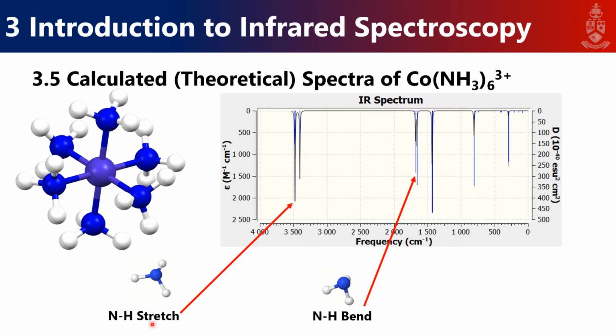There might be different variations of what they are, but the ones I wanted to look at are, for example, what is an NH stretch? Remember, on the previous slides, in that figure, we had a point where we said NH, and then NH also appears at a few other places. So this is how you go about it. You say, okay, that's an NH bend, but this is the NH stretch, and you just assign those peaks.